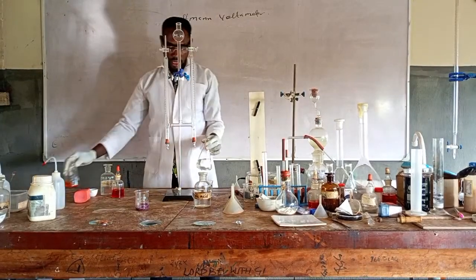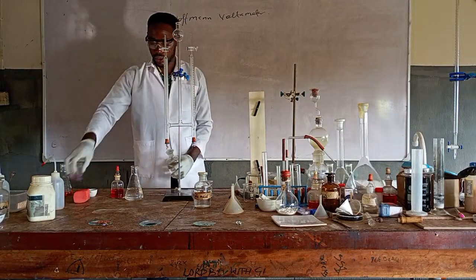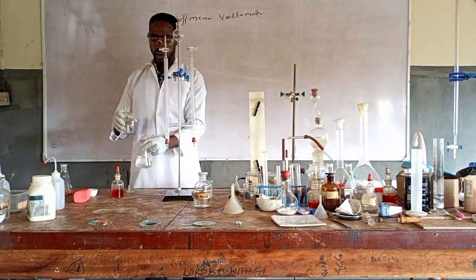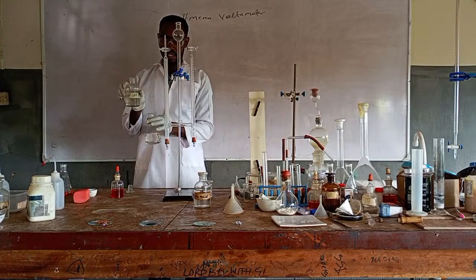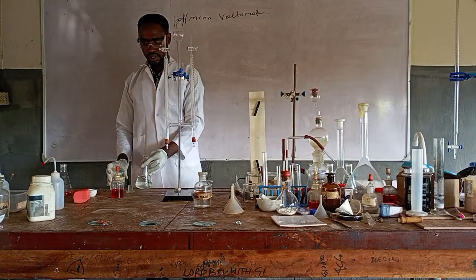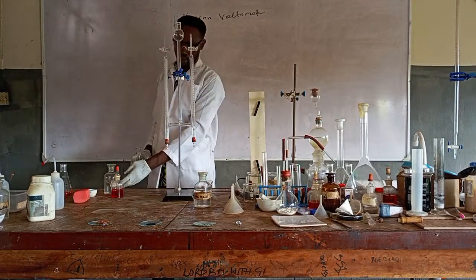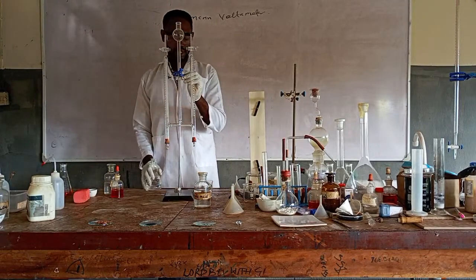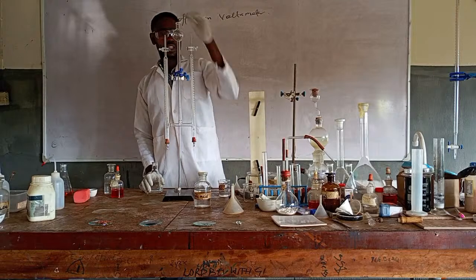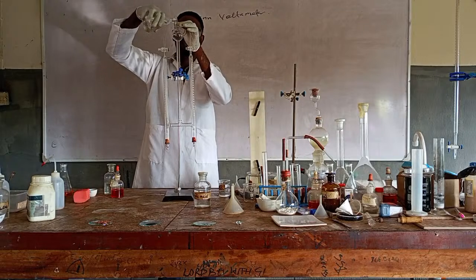Okay. Here is water, but water is a poor conductor, so to increase its conductivity I have to add acid. That's why we call it acidified water. It's not that we are electrolyzing the acid. I'm using H2SO4 to acidify it, just adding a little to increase the conductivity of water. That's why I acidified it with what? H2SO4. Sometimes they'll tell you electrolysis of acidified water. It is the same thing as electrolyzing water. If these are closed, the water will not go in well, so I have to open them.